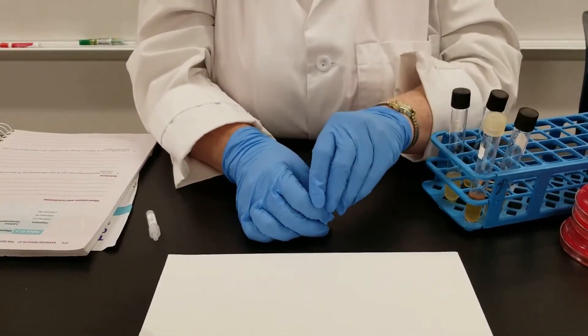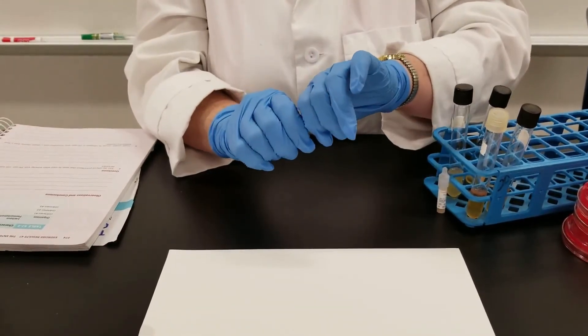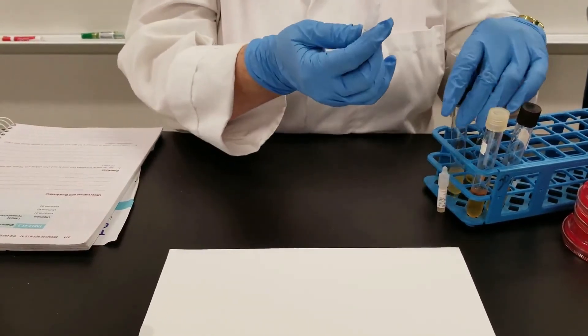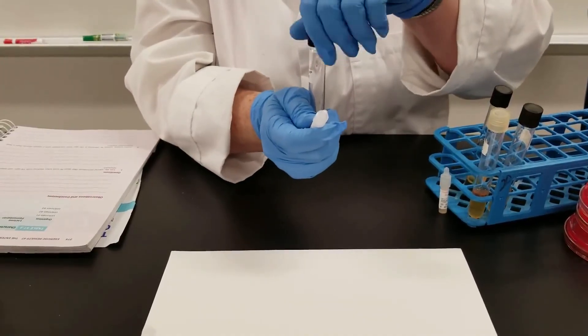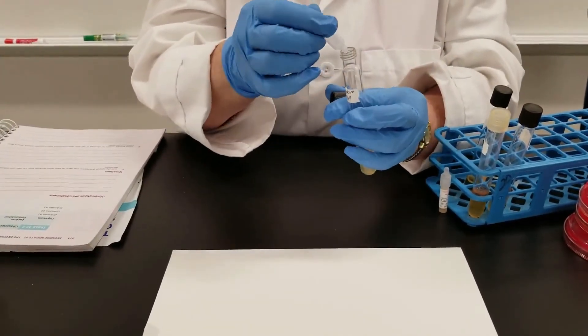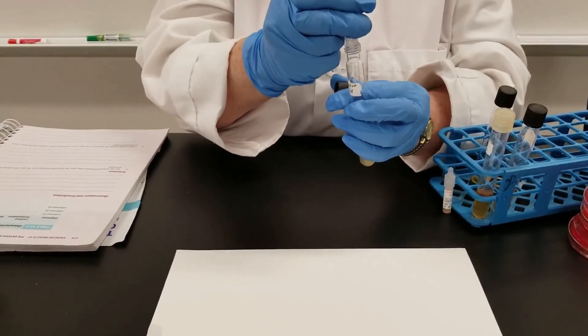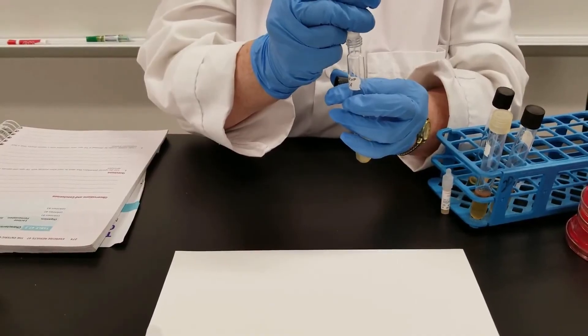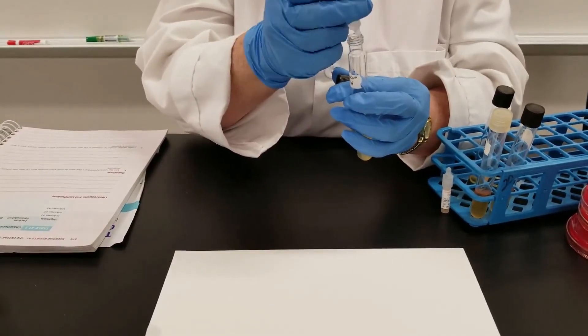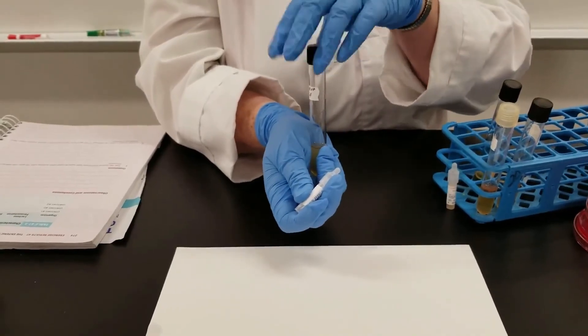Now you will add the reagent B. Once again, just squeeze it - that will pop the glass ampule on the inside. Once again, about ten drops. Add this to each one of the tubes. We are looking for a color change up on the top.